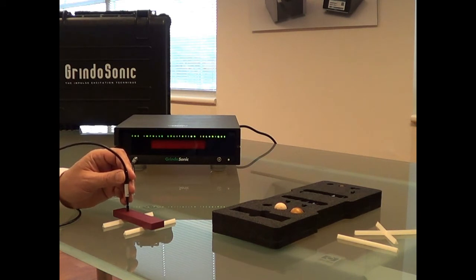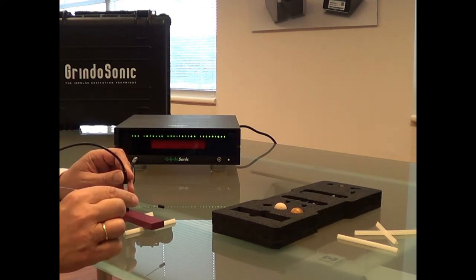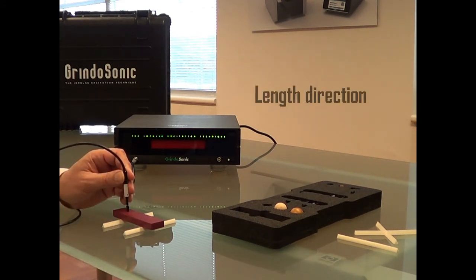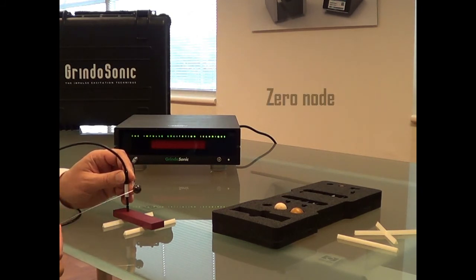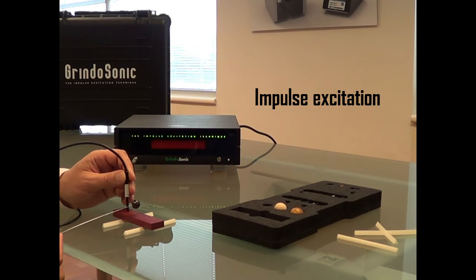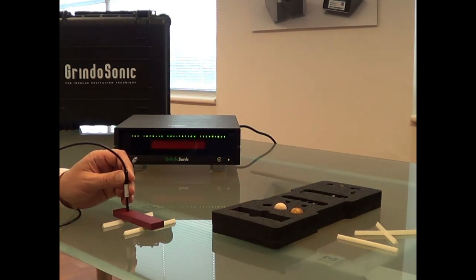We put the probe with a little dot in the direction of the length of the bar and we put it in the zero node. And then the technique is called impulse excitation. We excite the bar with a small impulse and we immediately get the measurement result on the screen.